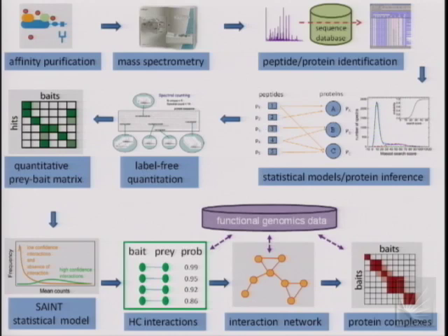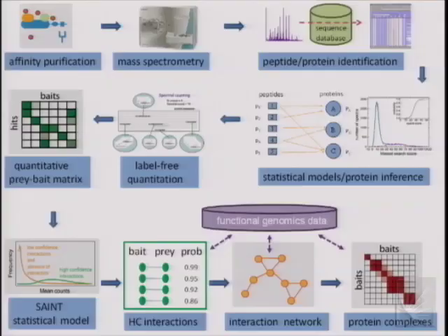But there is a lot of literature on computational methods for developing tools for global studies, such as tandem affinity purification studies that utilize network topology properties. So one may think that there are so many tools for clustering and confidence scores for protein-protein interaction data. I would say that probably 1% or maybe 0% of those tools are actually applicable to the data that you're generating here and the data that were presented. So that's really important to remember. And at the end, I'll mention some of the novel things that we're doing in terms of clustering of protein complexes. Again, not in the context of large networks, but more in local networks.